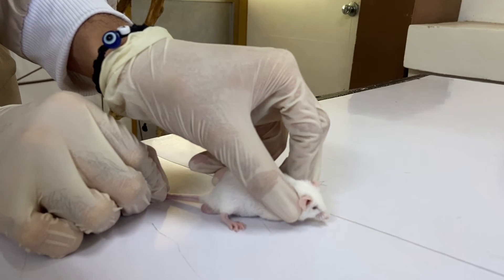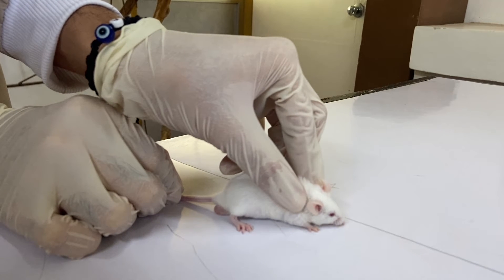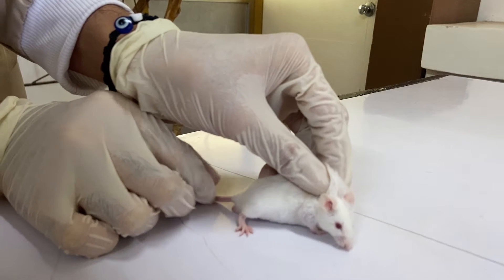Step 4: grip the loose skin extending over the back with the other fingers. Step 5: be careful not to impair the animal's breathing and venous blood backflow from the head to the chest.